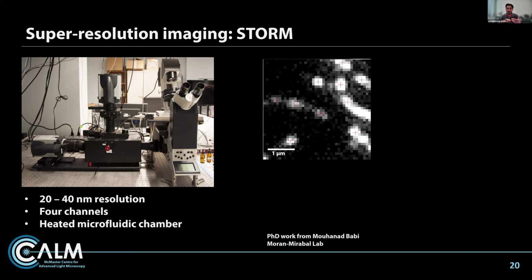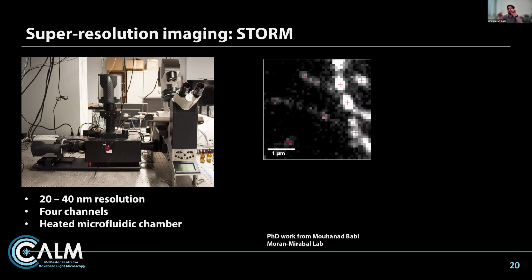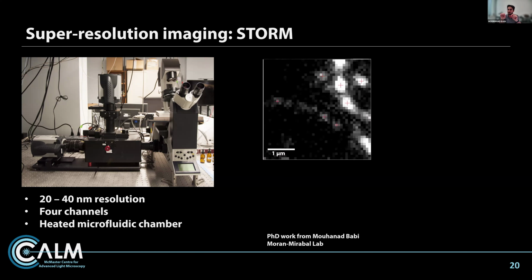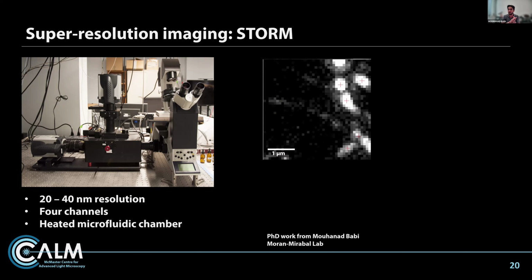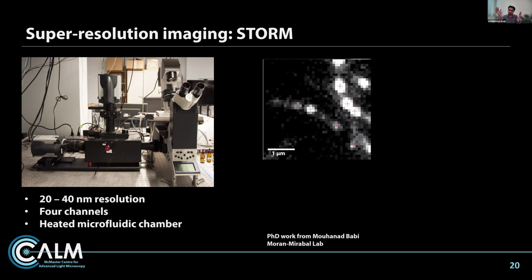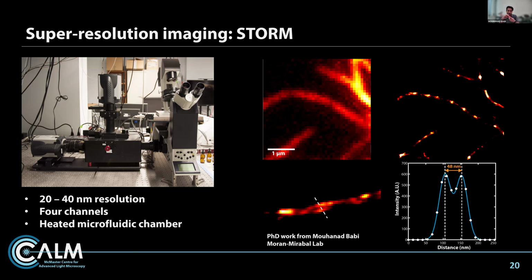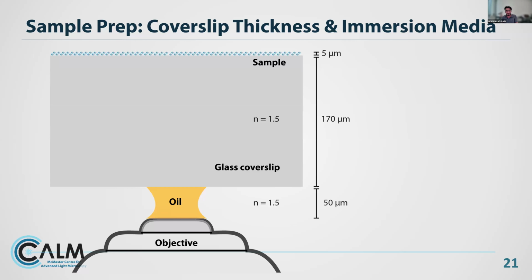And this process happens randomly, over a movie of 10,000 to 40,000 frames. We have all these different molecules turning on and off, and we can localize those molecules in different frames to eventually generate hundreds of thousands to millions of localizations within the image that we can, at the very end, combine together to reconstruct a super resolution image that would go from something like this to something that has up to 10 times more resolution, which in this case revealed a labeling pattern along the cellulose fibers, and allowed us to even see twisting within the fibers down to a sub 50 nanometer scale.